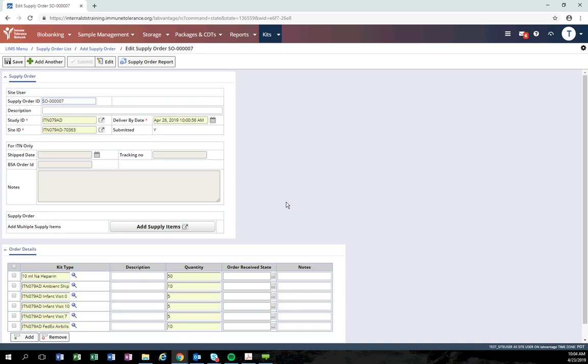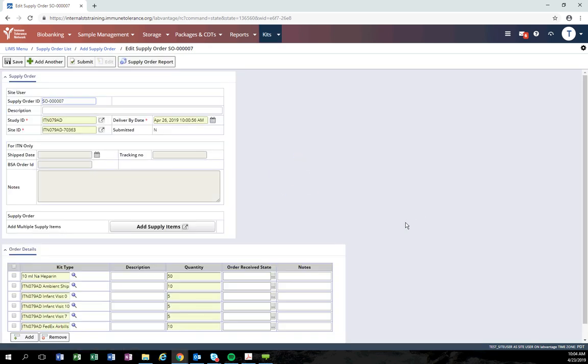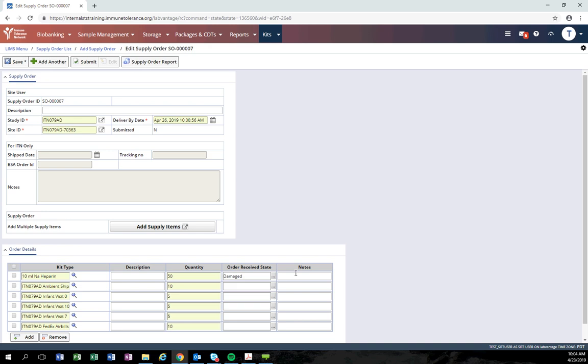To add a note that an item was missing or damaged, click the edit button. Then using the drop down field, you can select what happened, for example if it was damaged tubes or if you're missing an item.